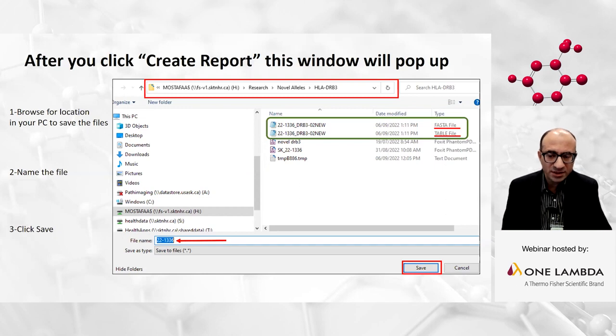And most important is, again, to remember the location of these files because it happened to me several times that after I saved them, I forgot where I saved them. And I had to go back to TSV and create them again.